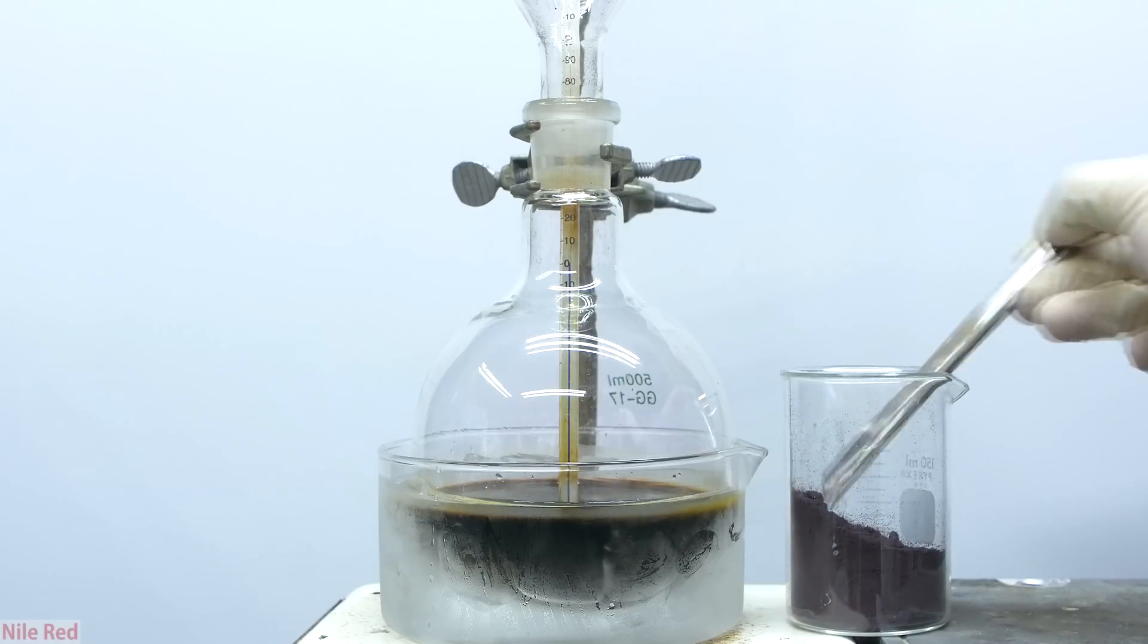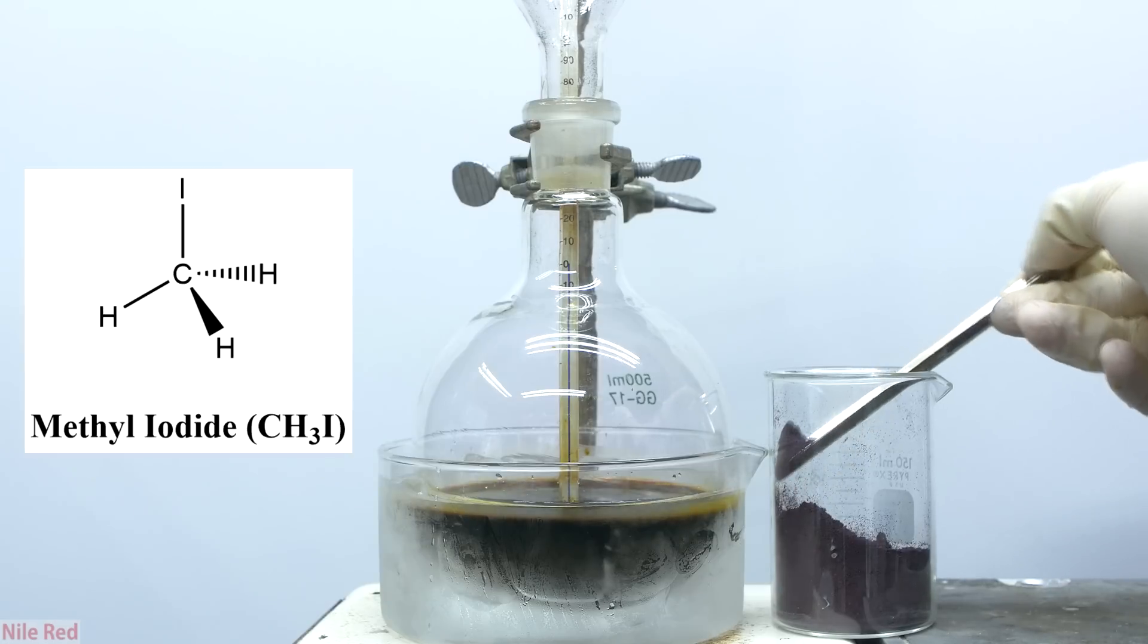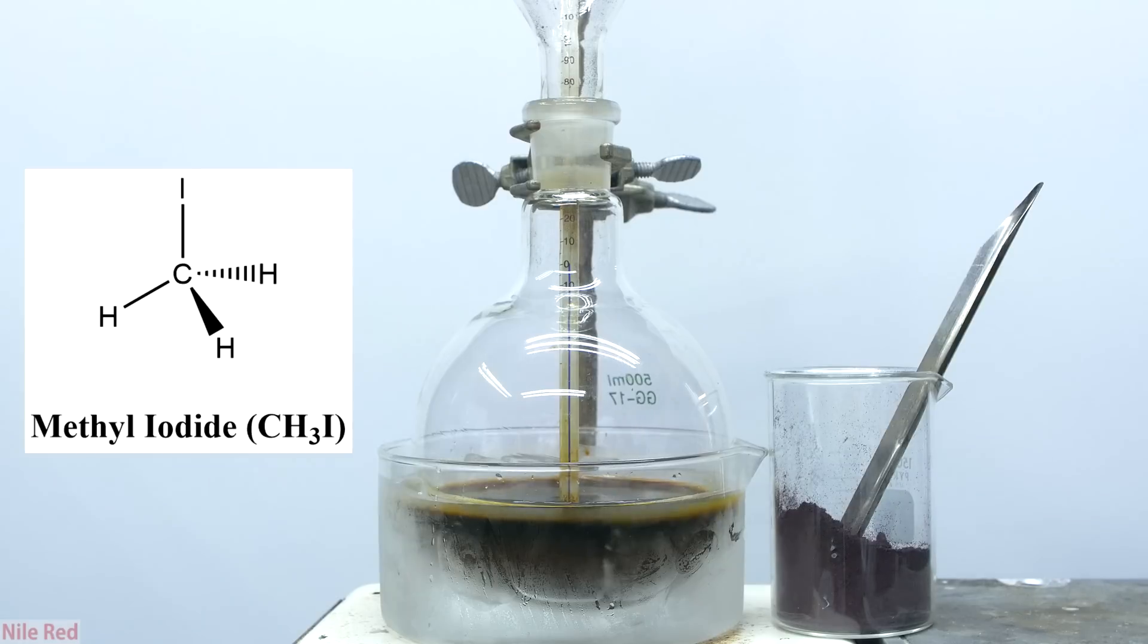Methyl iodide has almost no real-world applications and is mostly used as a chemical building block. The structure of methyl iodide is quite simple with a chemical formula of CH3I.